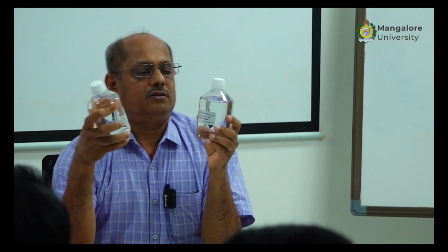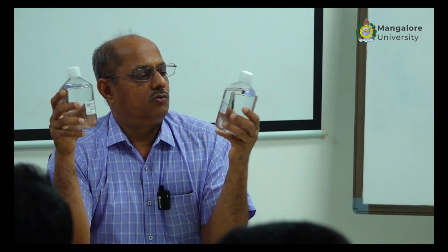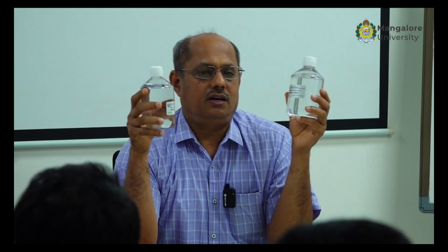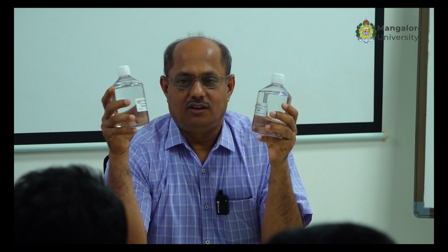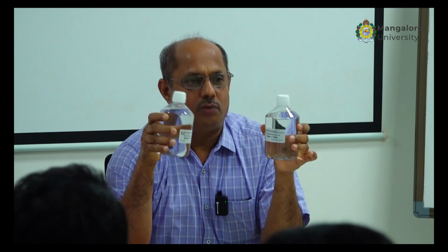And today what we do, we are giving you a set of samples, which are in different geometry. We have recently received a set of samples from IAEA for international intercomparison. So we already finished this assignment. We submitted the data and all our data was accepted. So what we do, we give the same sample to you. We know the activity of individual radionuclides in this. And we have standard reference materials also for this in the same geometry.